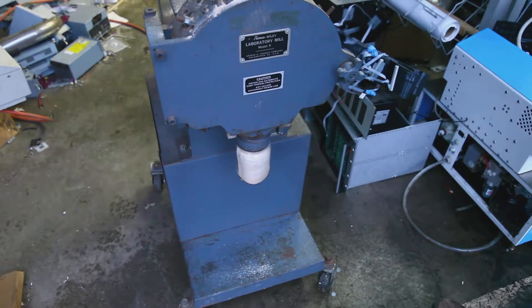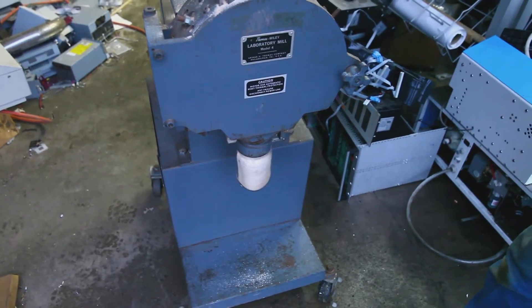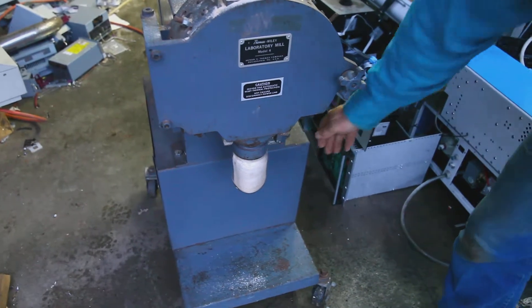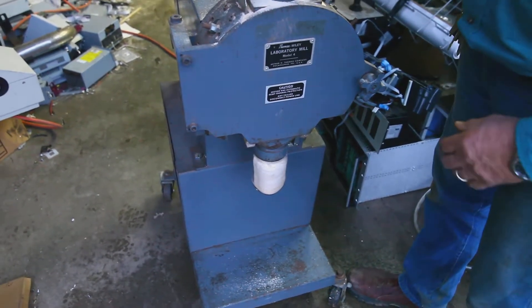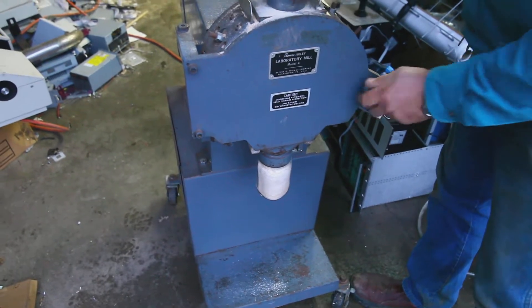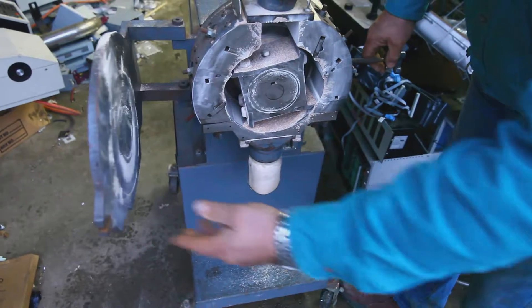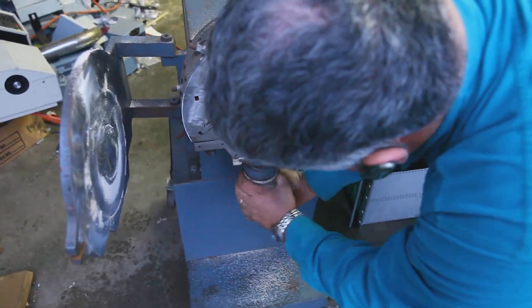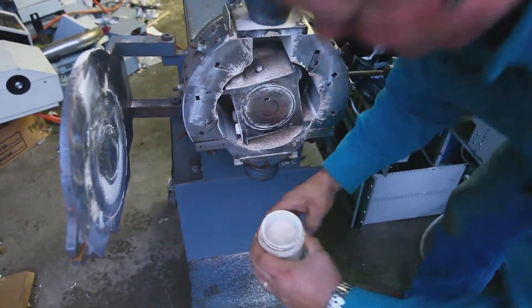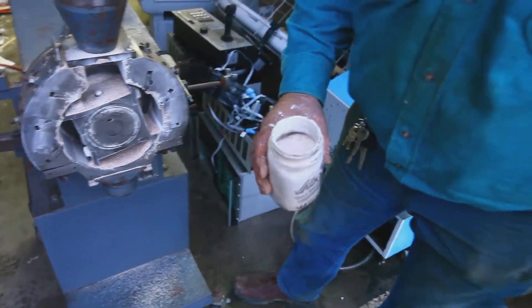Now we're going to take a couple minutes — the jar is full. It's pretty much a week's worth, so we'll turn it on. And there's our consistent sample that has gone through the screen.